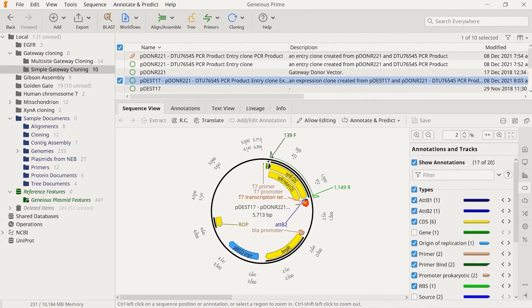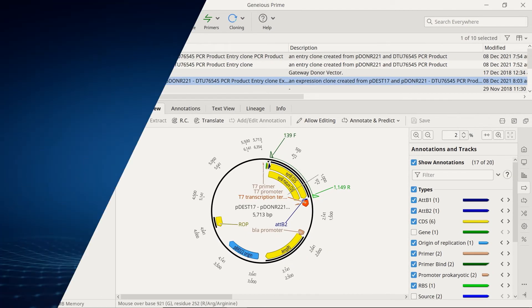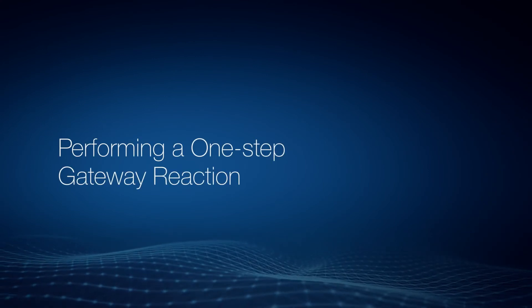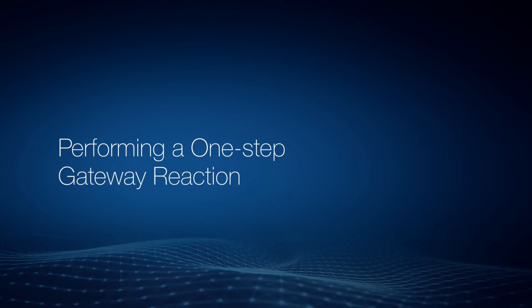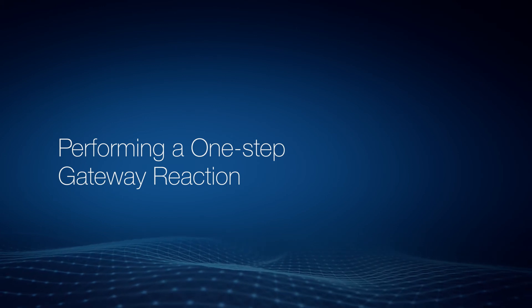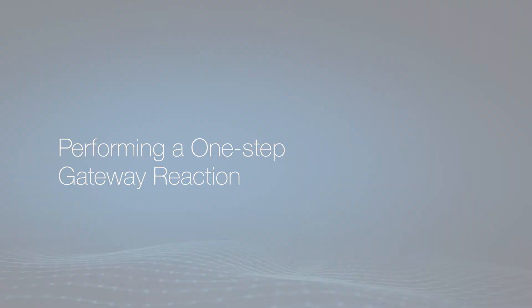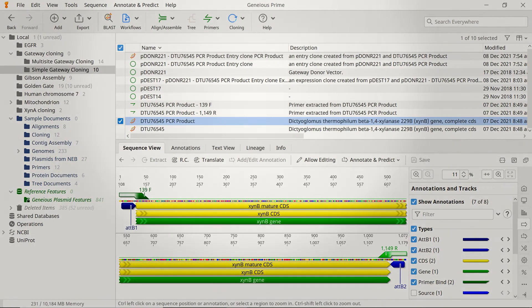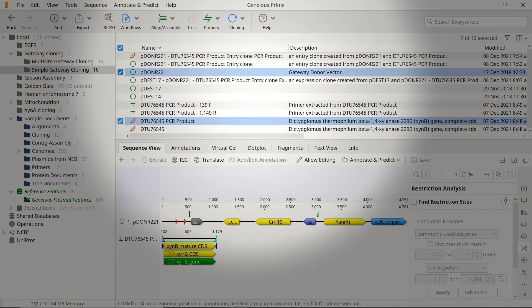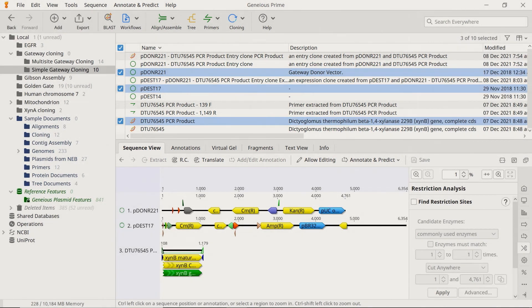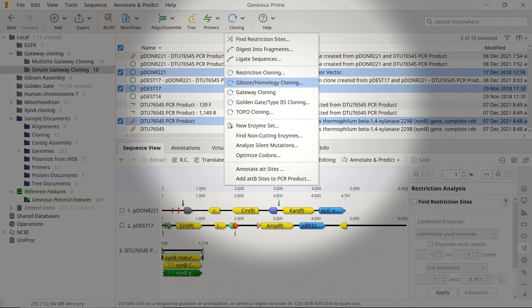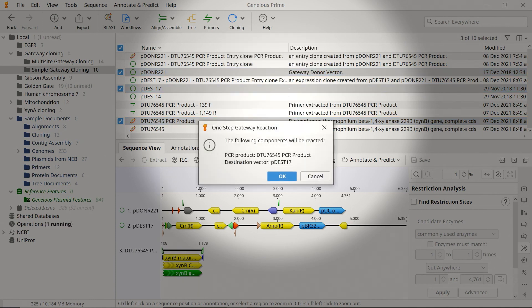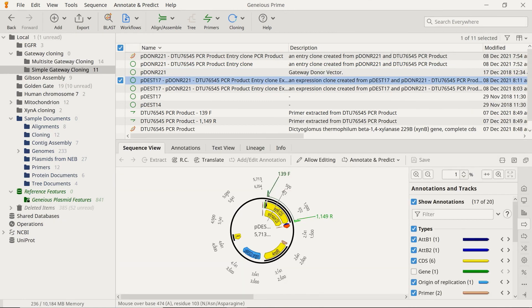Doing so will create the final expression clone. It's worth noting that Genius can perform the BP and LR reactions in a single operation, rather than simulating separate reactions. To do this, simply select the files containing your PCR product insert with attB sites, the donor vector and the destination vector. Then, as before, select the Cloning button and Gateway Cloning. After confirming the correct components in the one-step reaction, you will see the final expression clone.